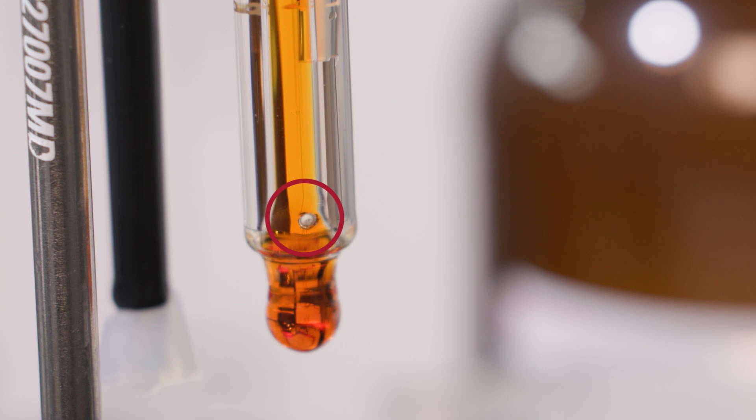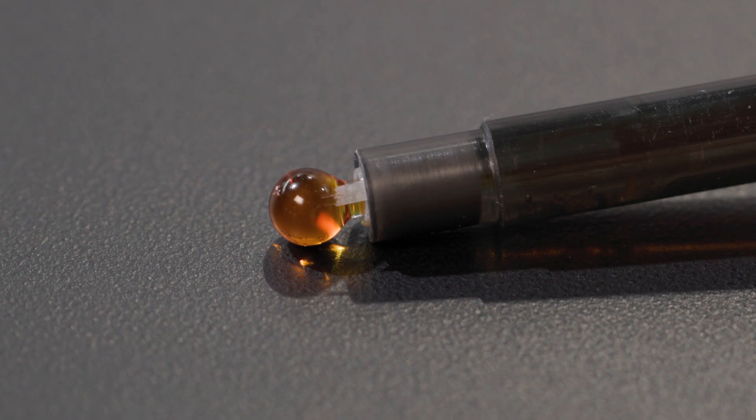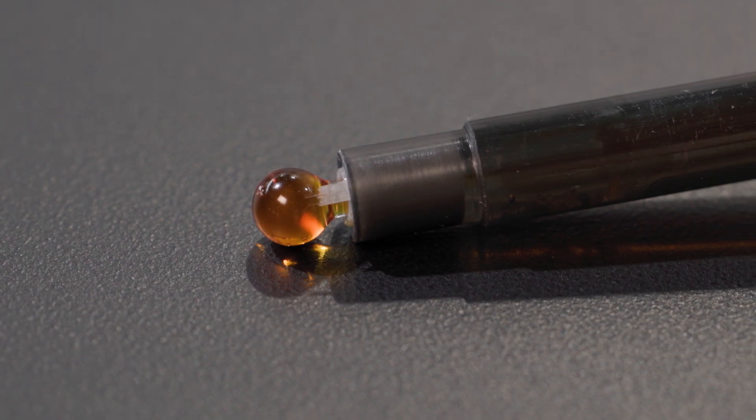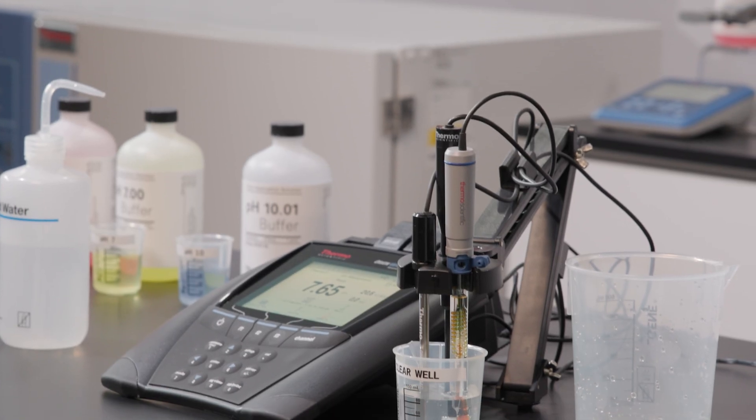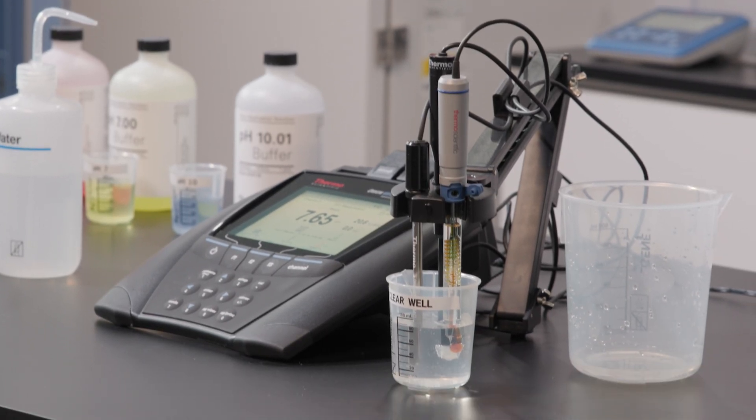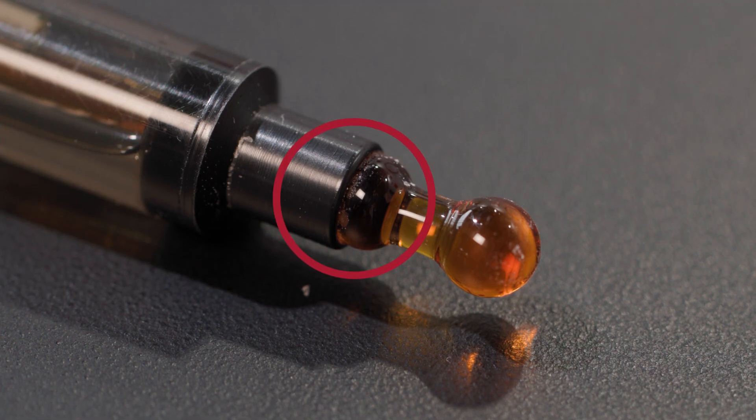Most glass electrodes have a porous ceramic junction, and many epoxy electrodes use a wick or fiber junction. These junctions are appropriate for most general-purpose samples, but can be problematic for others. For better results, use an electrode with a more stable reference system or a more suitable reference junction.